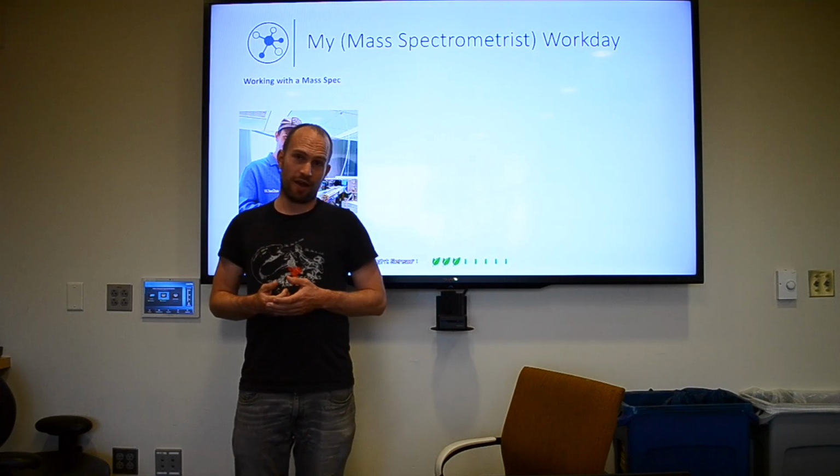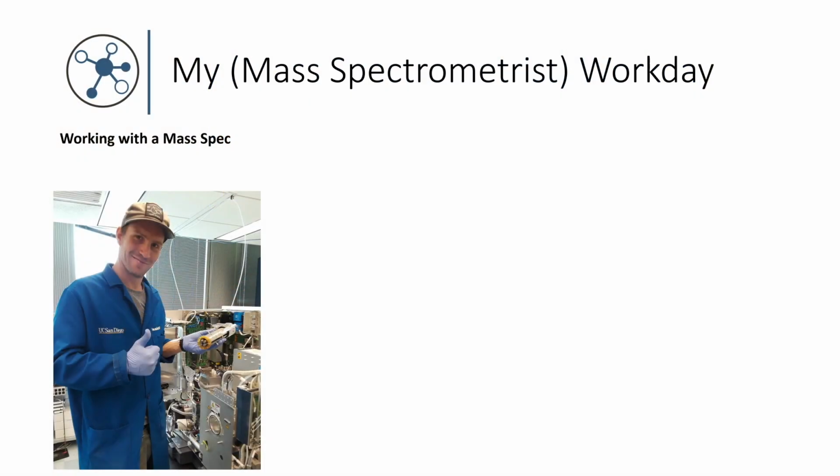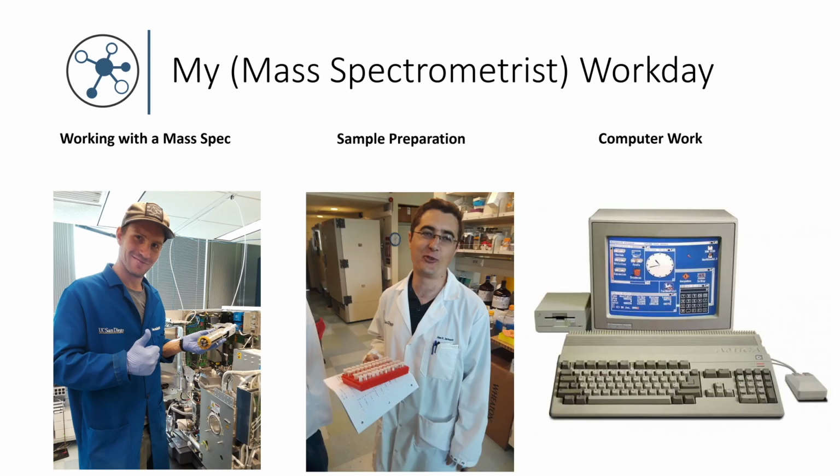If we look at my typical day, I spend some time cleaning the instrument and running samples, but I also of course have to prepare samples, and most importantly probably have to make sense of the data, which obviously is all done on a computer. If we put numbers on this, I probably spend just a little bit of my time in the lab in front of the instrument, and most of my time in front of a computer analyzing this data.